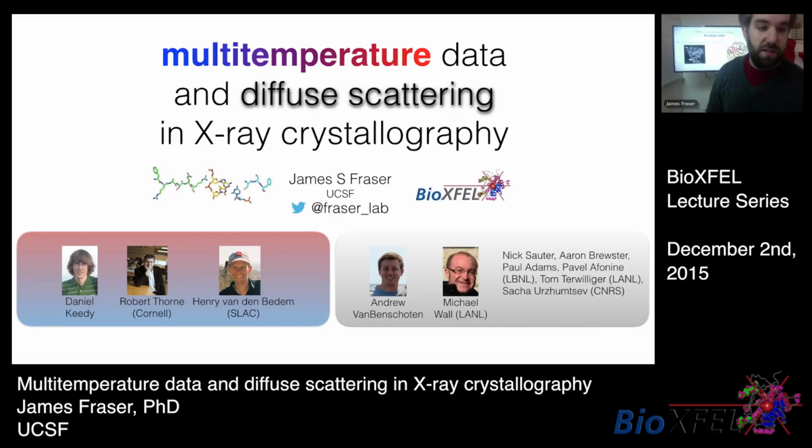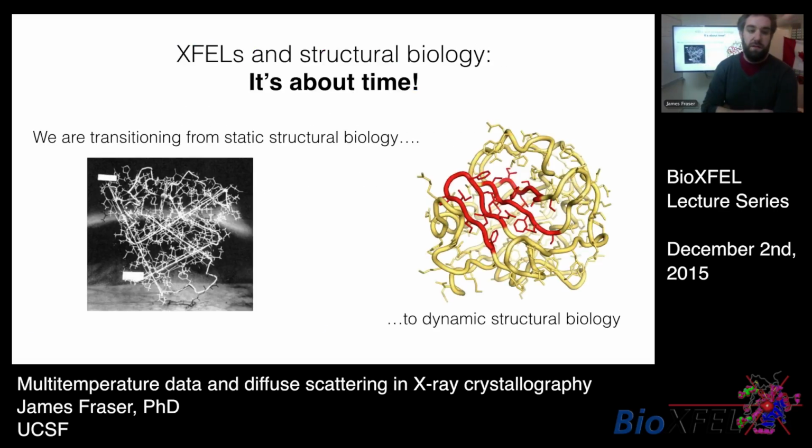So obviously, this audience really cares about the use of X-ray free electron lasers in structural biology. And I think one of the obvious and most powerful opportunities is really to introduce the time dimension more into crystallography. So it's really all about time. I think we're transitioning from really static views of structural biology to much more dynamic views of how proteins move as they undergo their functions.